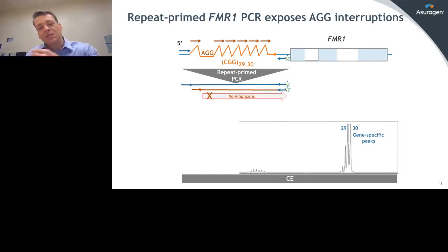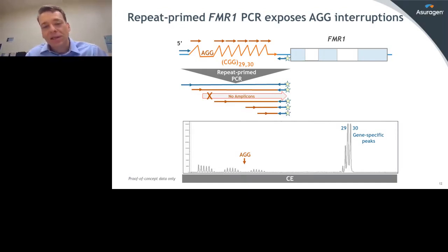So what it looks like, this is a sample of a 29/30, and again, this is SeqStudio data. You can see the 2 peaks here. One of these is a 29 and a 30. This is very different than what you'd see for a 29 or for a 30 homozygous. SeqStudio differentiates those very nicely.